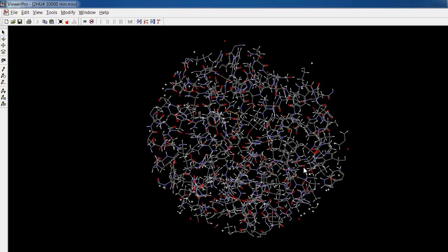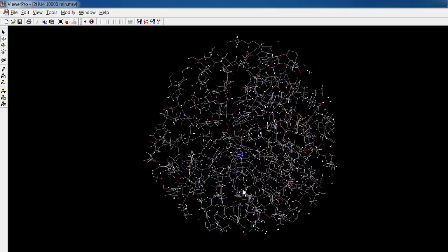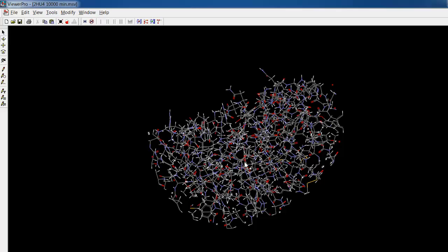This is the enzyme Tamiflu complex. Tamiflu, by the way, is also known generically as oseltamivir. If you hit the rotation tool up here and rotate it, you'll notice that the enzyme, which is kind of big, looks sort of like a half of a sphere. The reason is once again because this is not the actual true full enzyme. It is a modified model of the enzyme that Dr. Harris has sort of scaled down.